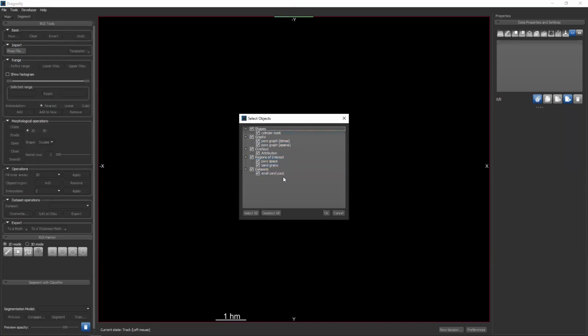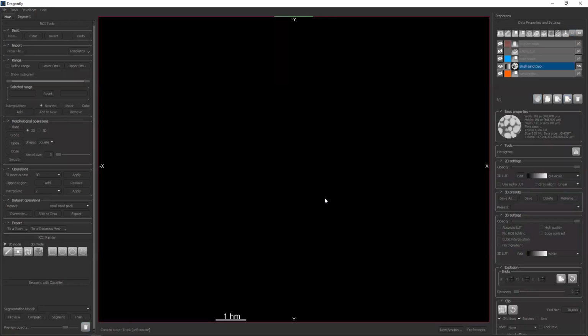You see that there are a number of objects encoded in this one file. I do not need the graphs that we had yesterday, but I will keep the shapes, the overlays, the regions of interest, and data sets. So we have had lessons on images, which we sometimes call data sets. Today is starting a lesson on ROIs and multi-ROIs. We have not had a lesson on shapes or overlays. We'll get that on the agenda before long. I'm going to go ahead and import these data.